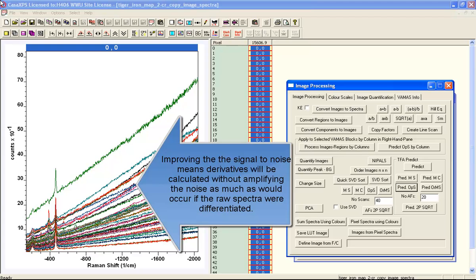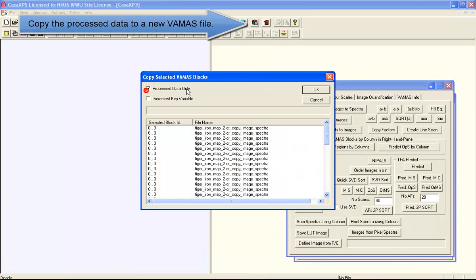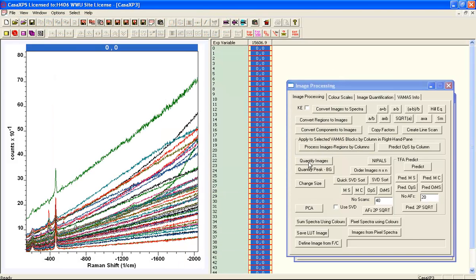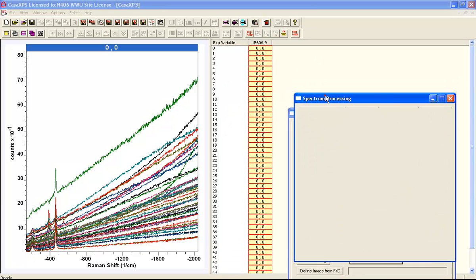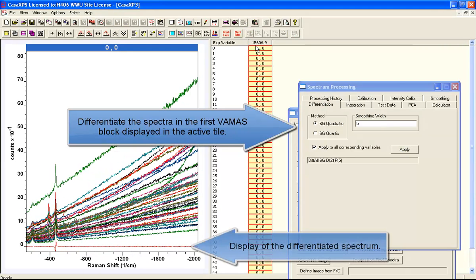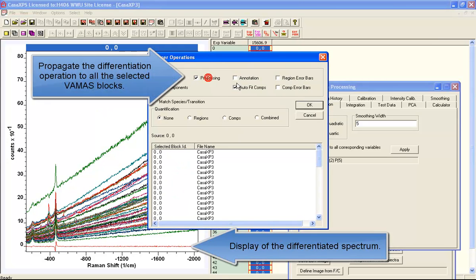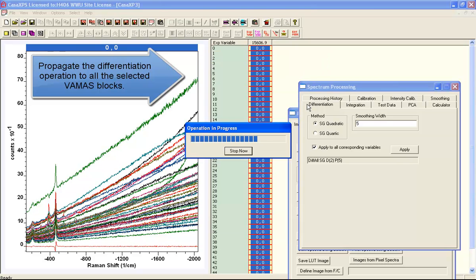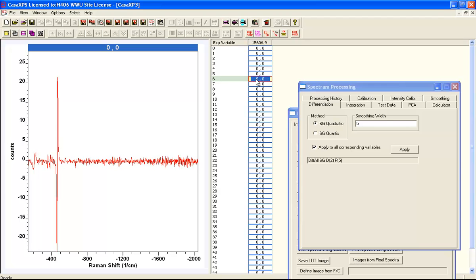We'll use 40 scans. That means we're going to use a 40-dimensional eigenvector calculation. We're going to reproduce the data using 20 abstract factors, so we won't expect to get rid of all the noise, but we'll get enough so that when we do the differentiation, the spectra produce the characteristic peak shapes rather than the Gaussian peak shapes without too much noise.